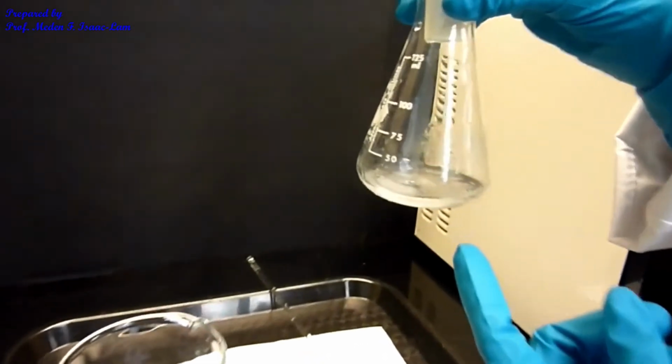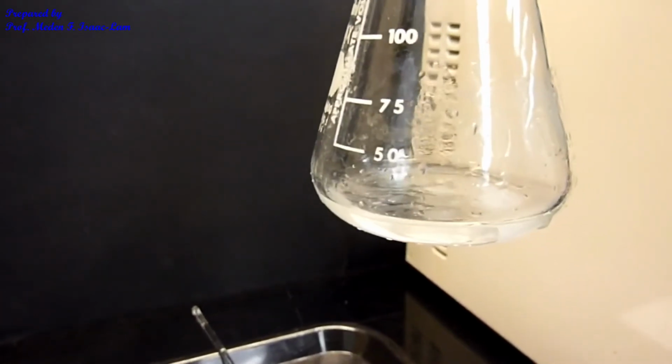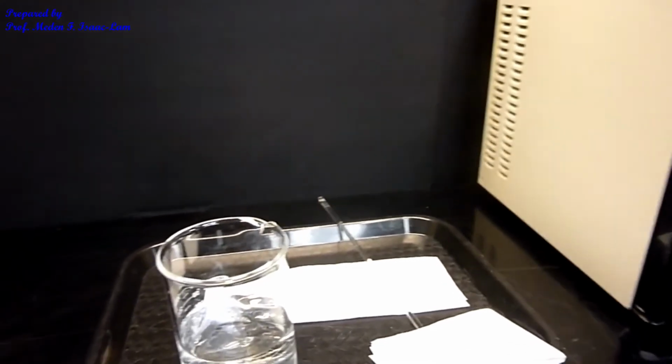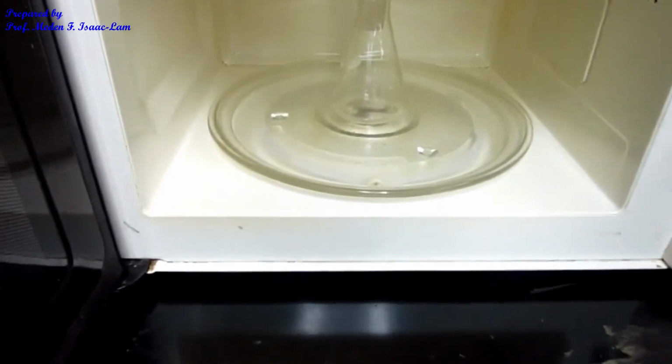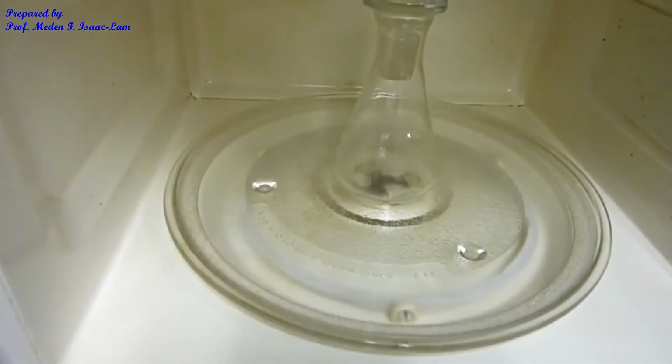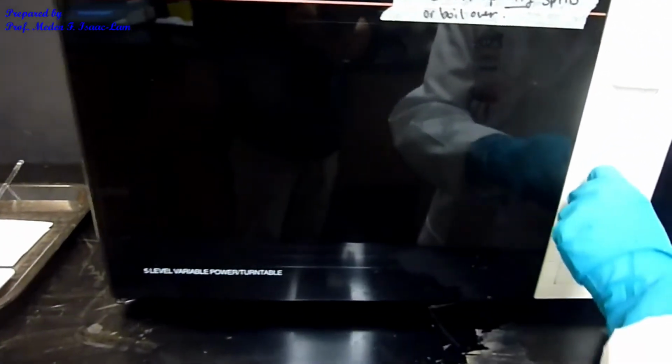So that's our sample, that's our reaction mixture. We want it to precipitate and come out of solution. So I'm gonna put it again in the microwave, just 1 minute.